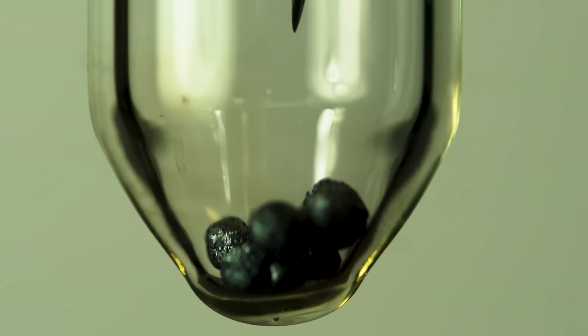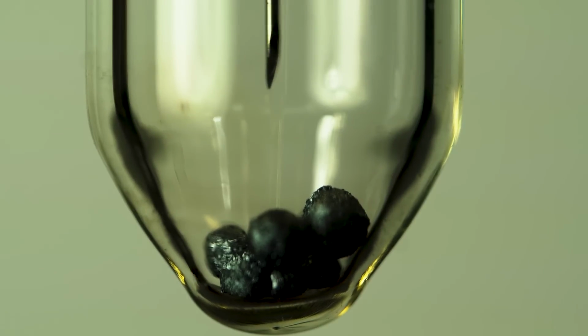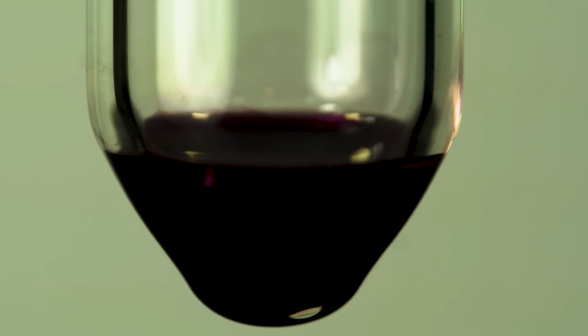You know that white phosphorus dissolves very well in carbon disulfide, but so does elemental iodine. Thanks to iodine solution in carbon disulfide, it's possible to demonstrate a reaction with the aqueous solution of sodium azide. Before we move on, I want to show you how decomposition of sodium azide looks one more time.